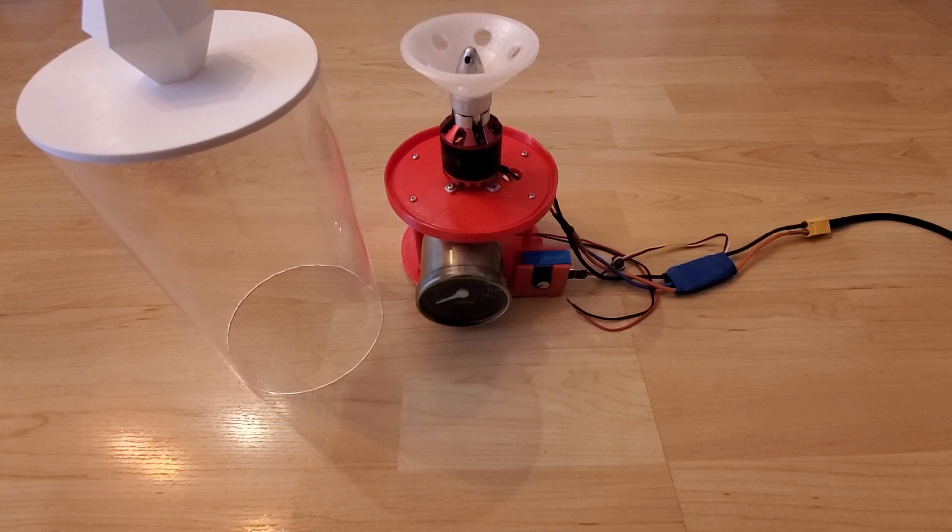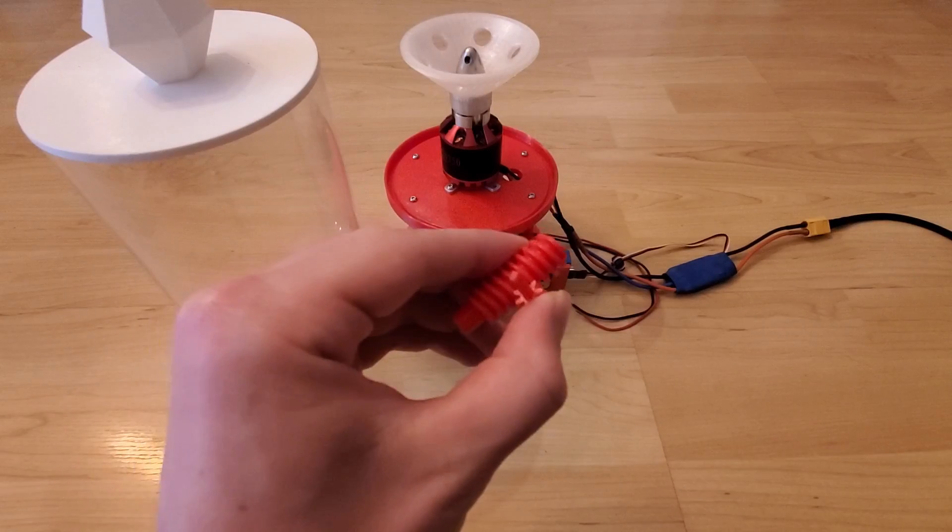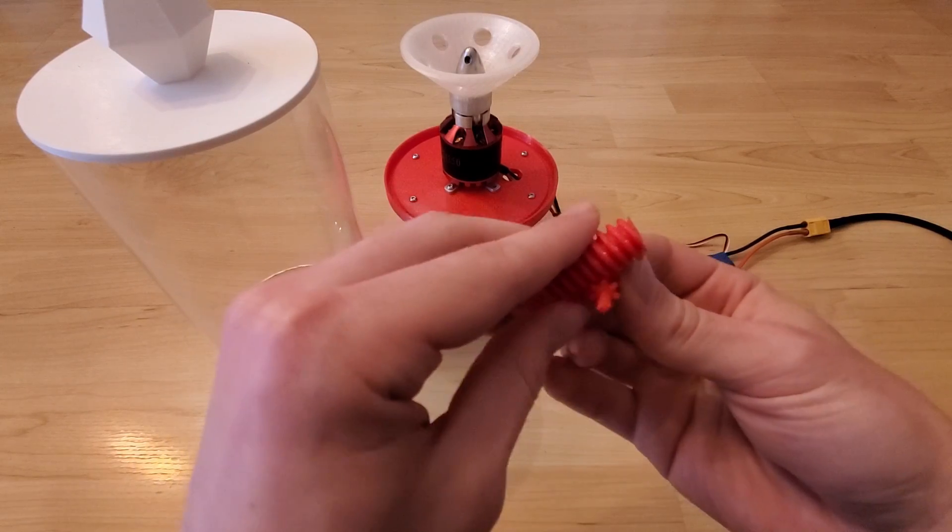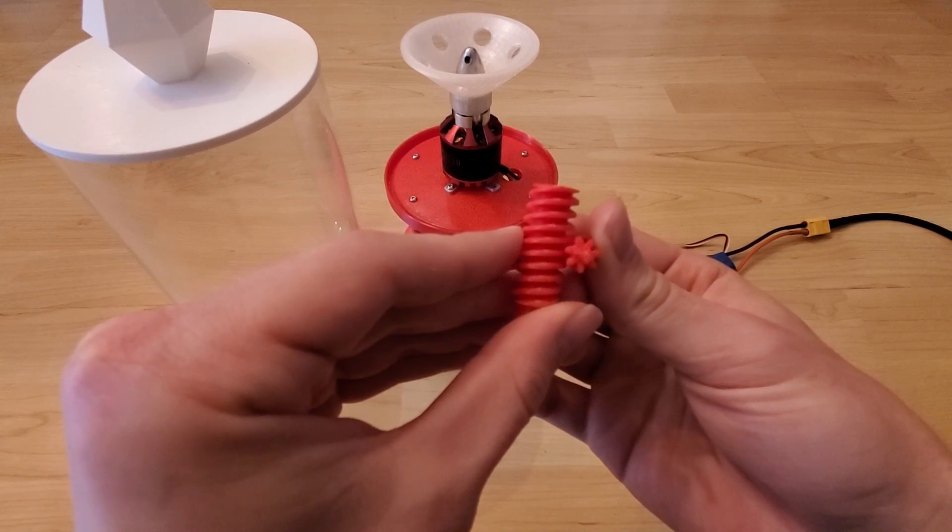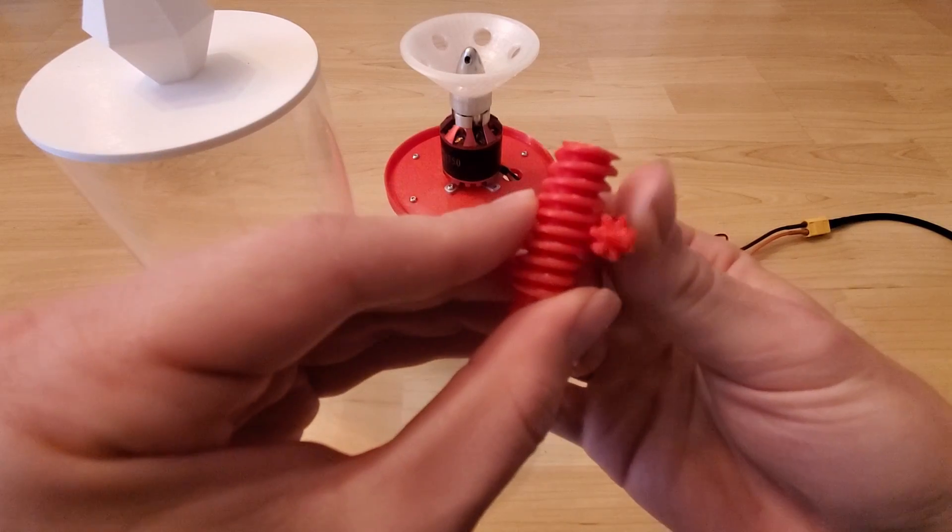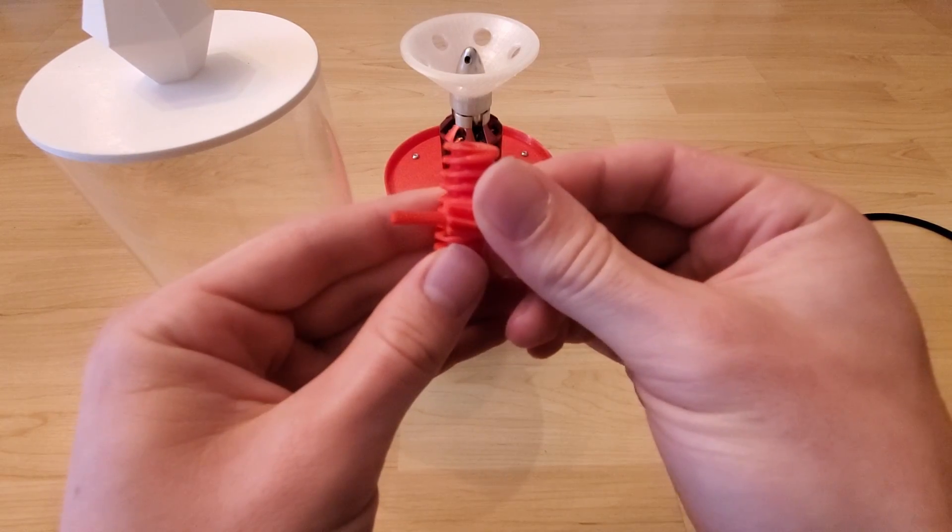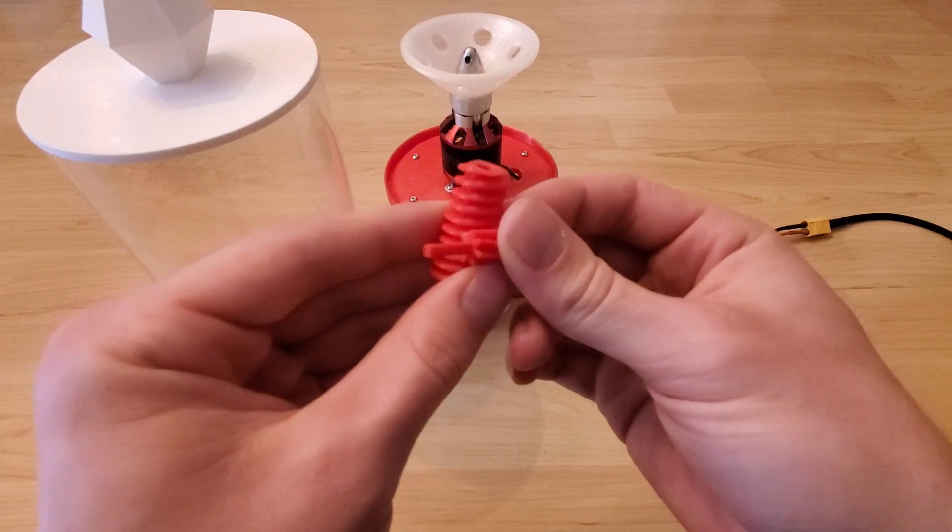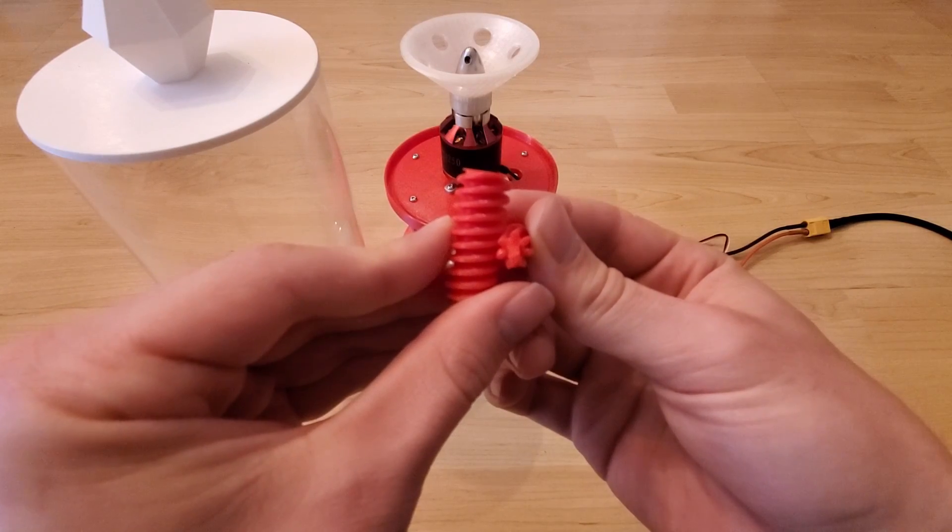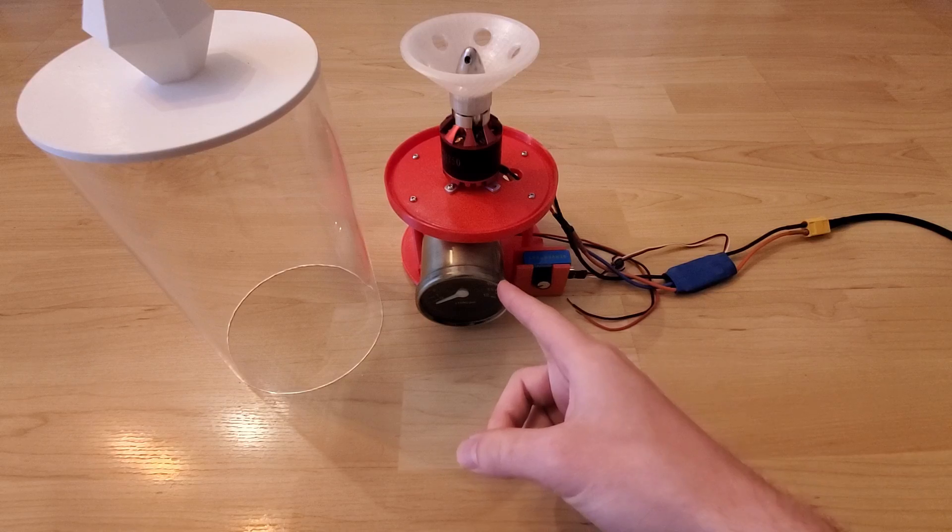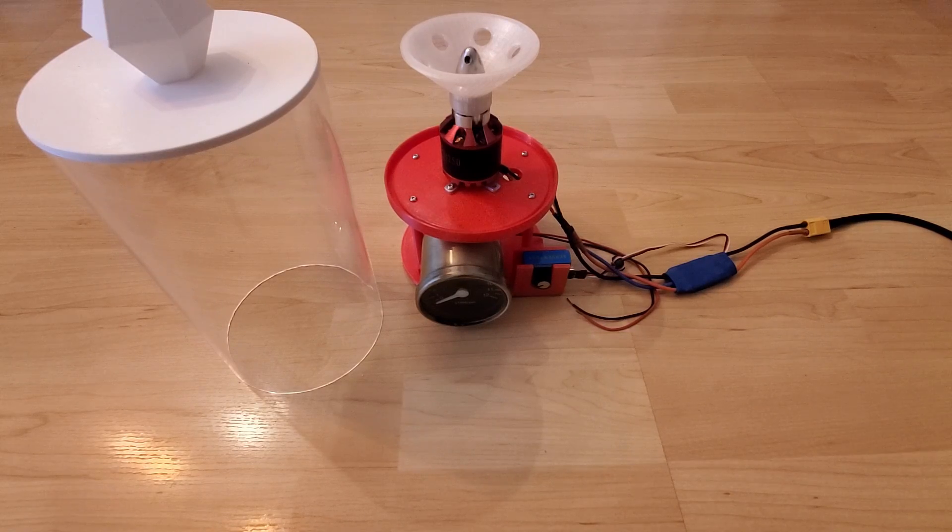The way that I managed to do this was with a worm drive system. So instead of using the pulleys for the one to seven gear reduction, I'm able to do that with a worm drive here, saving tons of space, and it also shifts it to a 90 degree angle which allows me to mount the Speedo facing forward here instead of vertically like the previous position.